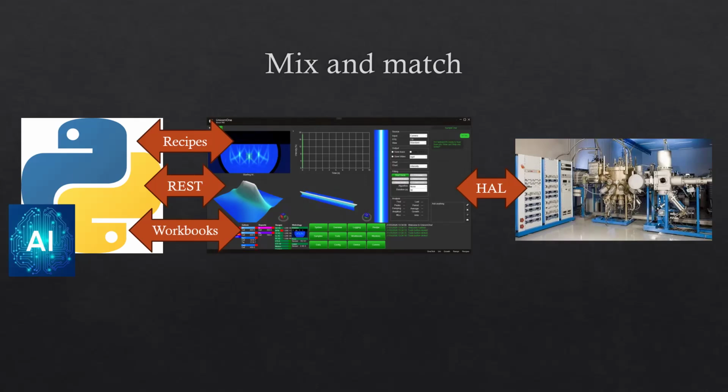Because each method operates against the same underlying abstraction, developers can change or extend the application layer without rebuilding the hardware integration underneath it. This is an important difference from traditional bespoke control software, which often becomes increasingly difficult to maintain as new functionality is added. UnicornOne is deliberately designed around the opposite model, a stable operating platform extended through defined interfaces. The underlying architecture remains the same. UnicornOne provides the hardware abstraction, structured data, and process control, while users remain free to choose how and where their AI runs.